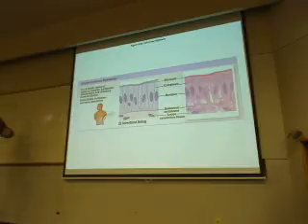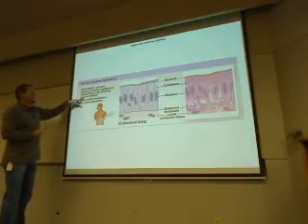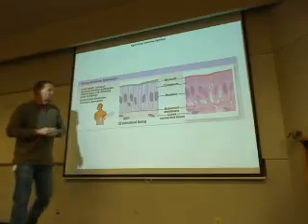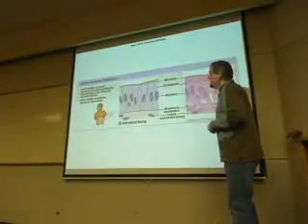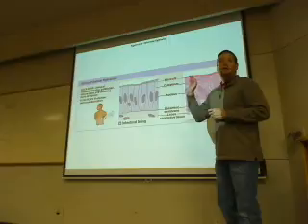So it says lining of the stomach, intestines, gallbladder, uterine tubes, and collecting ducts of the kidneys. And when they say collecting ducts of the kidneys, those tubes that we saw before were not collecting ducts. Those are called nephron tubules, and they lead to another big tube called a collecting duct. Okay? And when we take a look at these, one of the things we'll notice quite often with the columnar epithelium is they're held really, really tightly together.